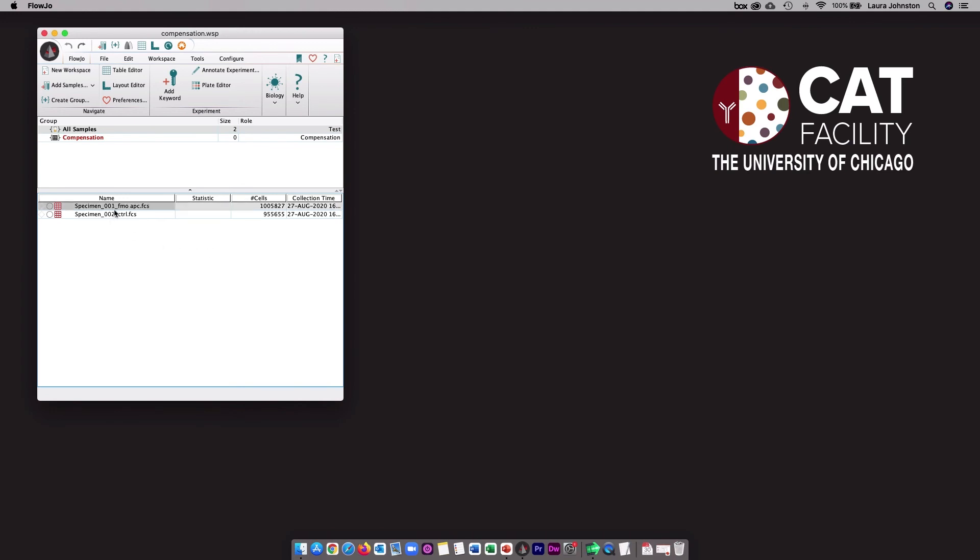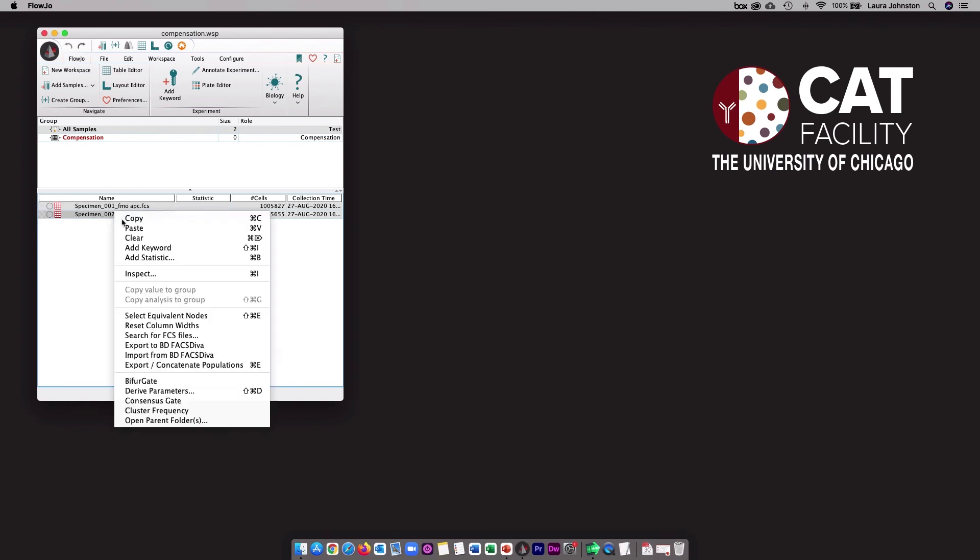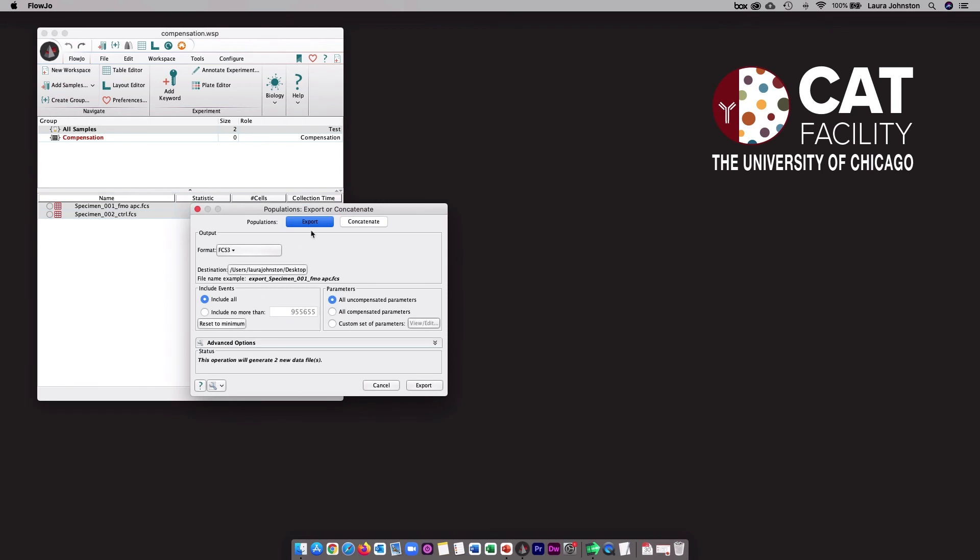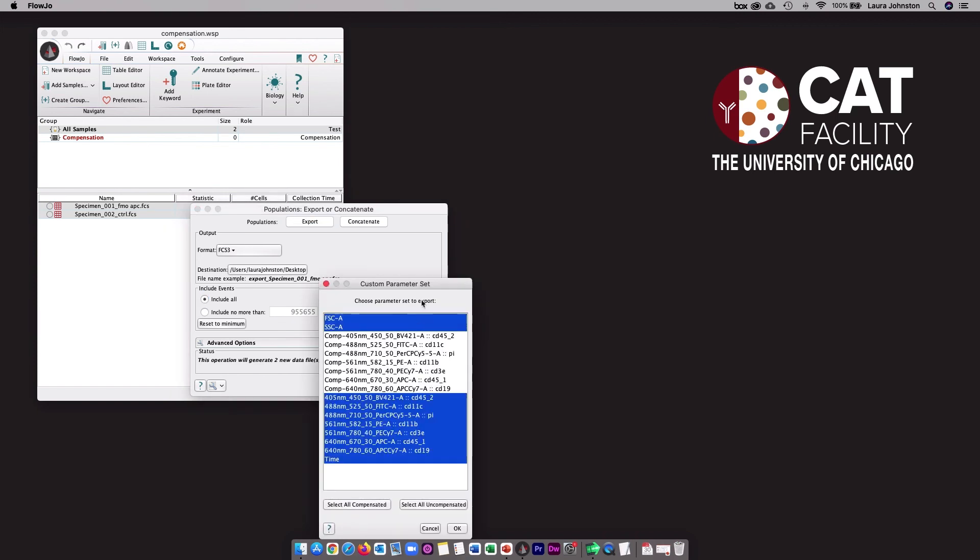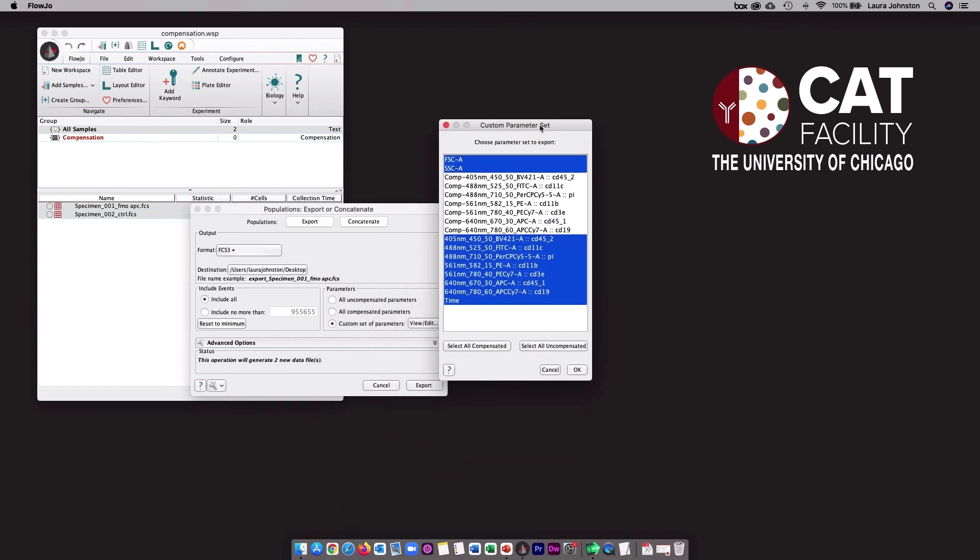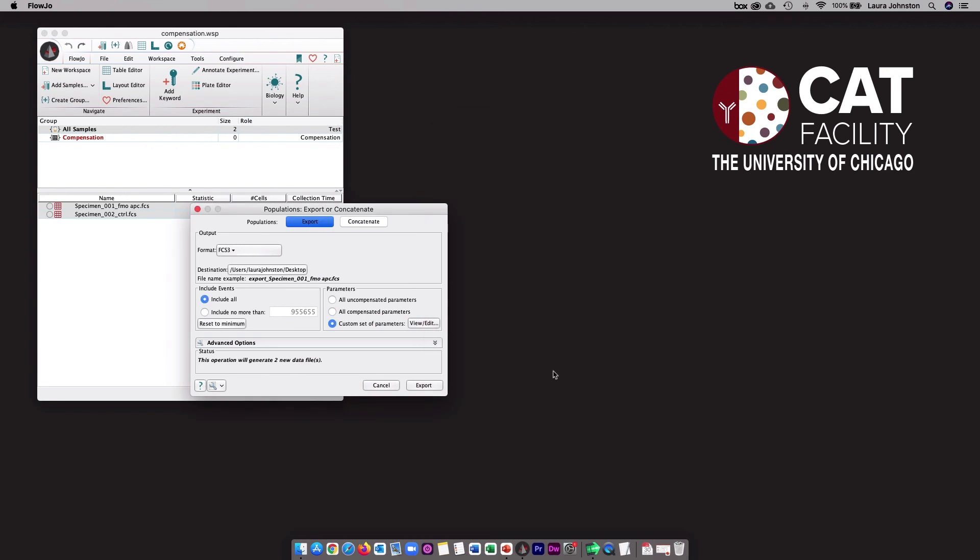The second option is to export a brand new FCS file. So you can select all of the files that you want to export, then right click and select export. You can choose which parameters to export. Maybe you just want all compensated parameters, or maybe you want to select a custom set of parameters. You can also tell FlowJo where to save your files. When you click the export button, that will generate brand new FCS files that have the FlowJo compensation matrix packaged into it.